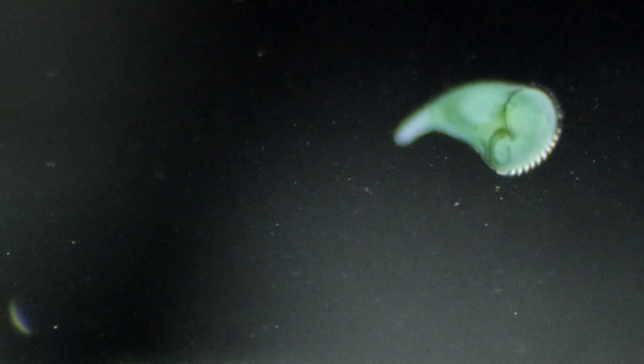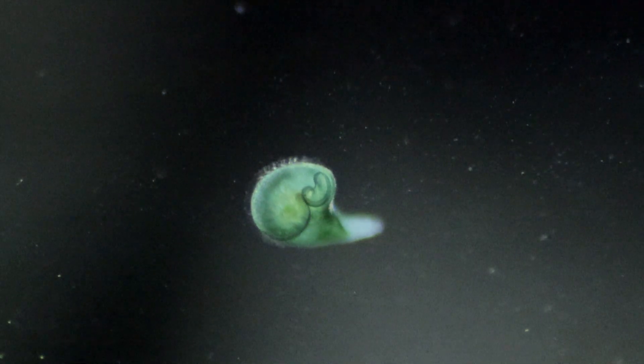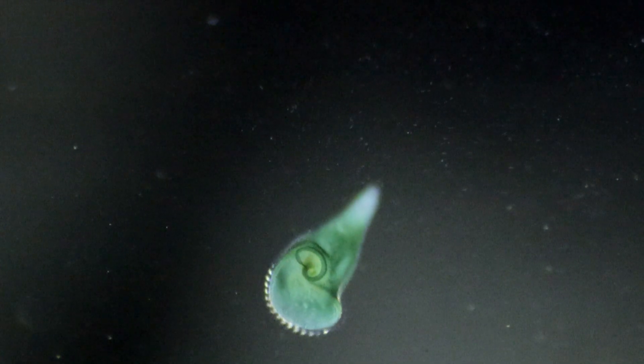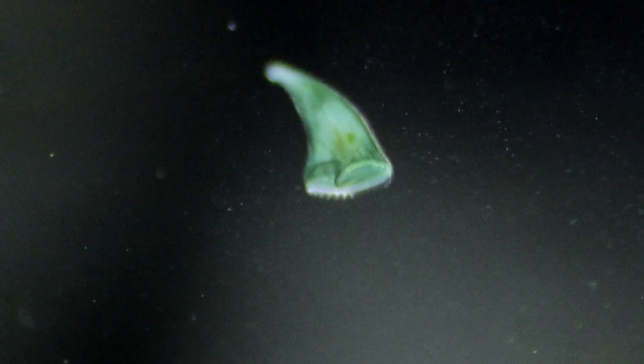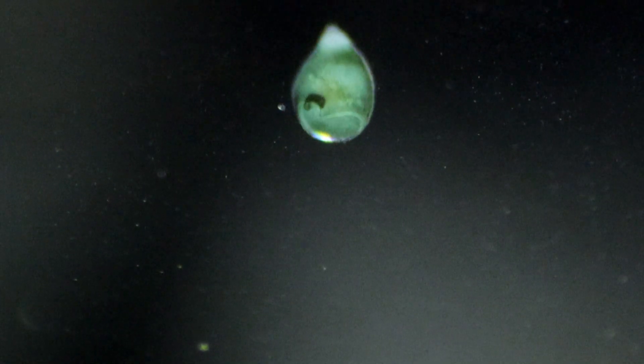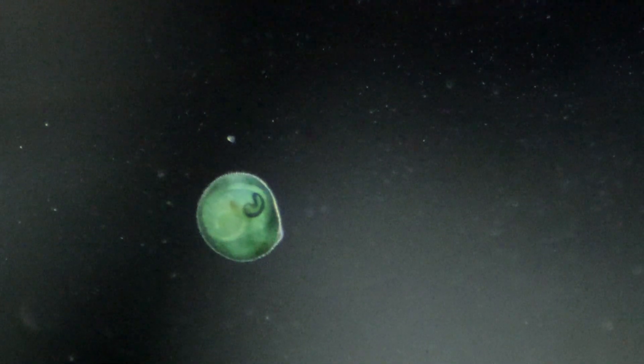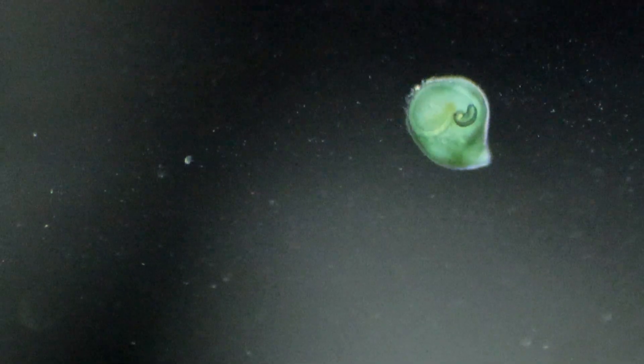That being the case, it was pretty tricky to be able to film, because when the stentors are swimming at different heights in that tiny little droplet of water, it comes in and out of focus very easily — and there's nothing I can do about it. You kind of almost film by just hoping that it's going to come into focus, stay visible for a while, and then drop out of focus. If you constantly keep trying to chase the stentor, you're just not going to have that much good imagery. But I do think I managed to capture some pretty awesome visuals of a stentor and its cilia.